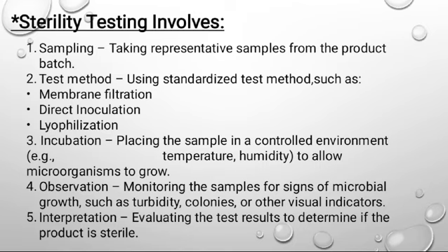Fourth, observation, monitoring the samples for signs of microbial growth such as turbidity, colonies, or other visual indicators. Fifth, interpretation, evaluating the test results to determine if the product is sterile.